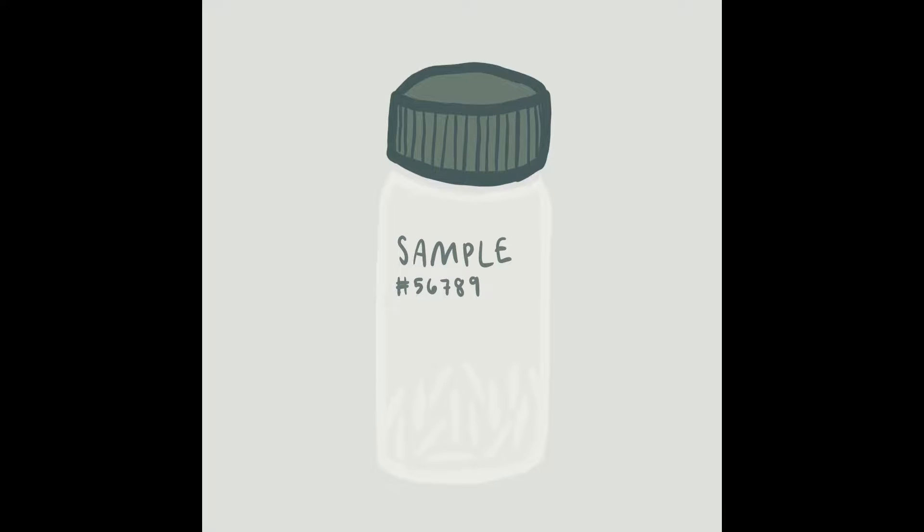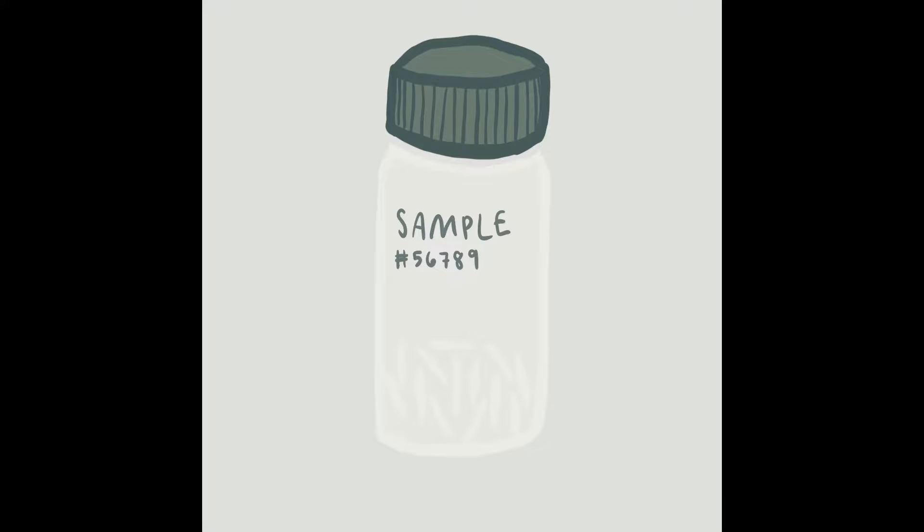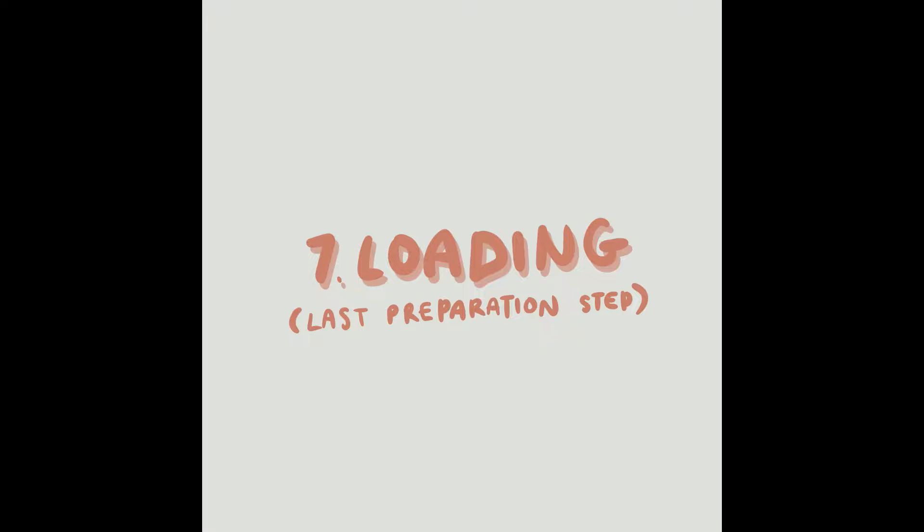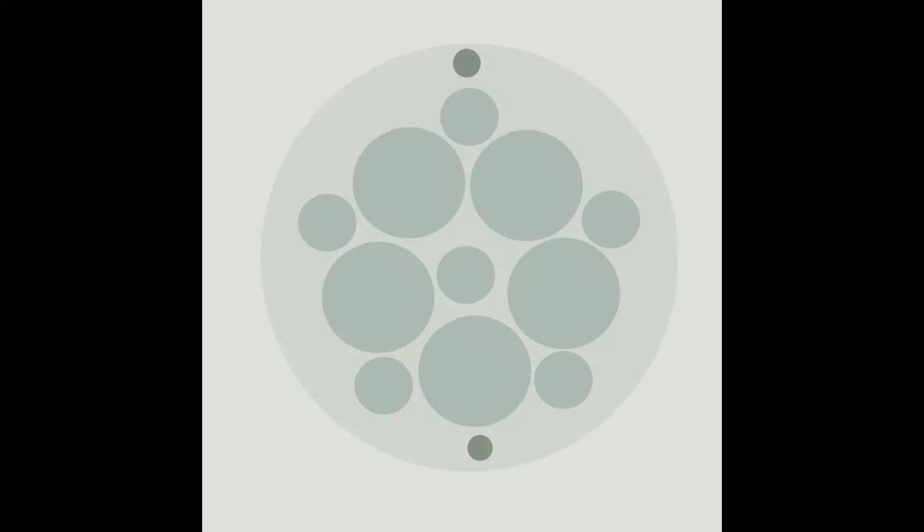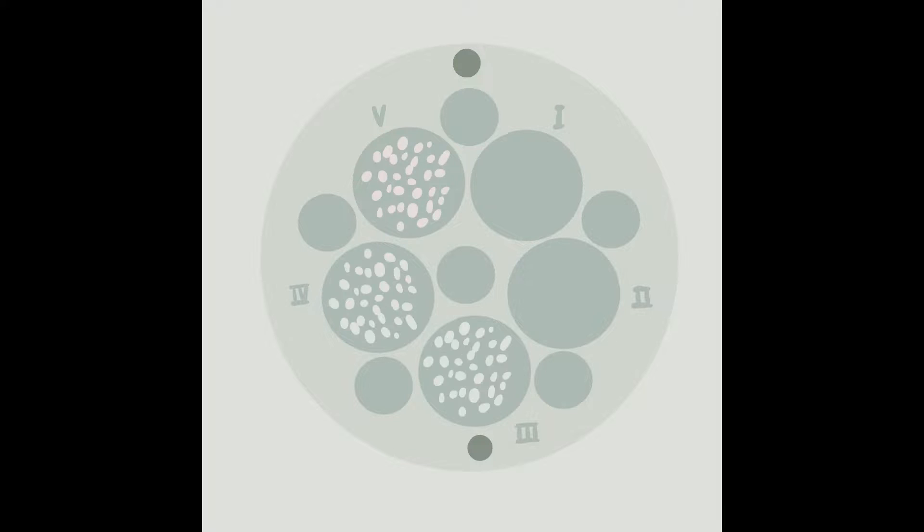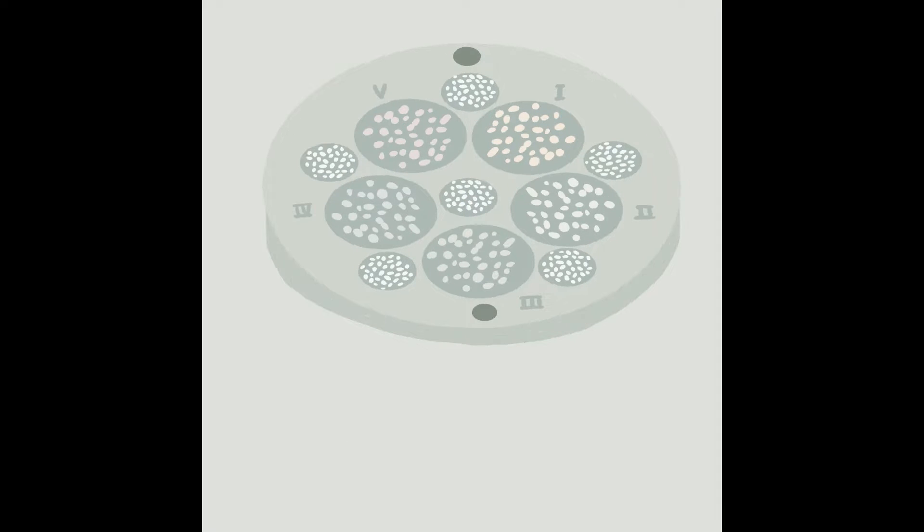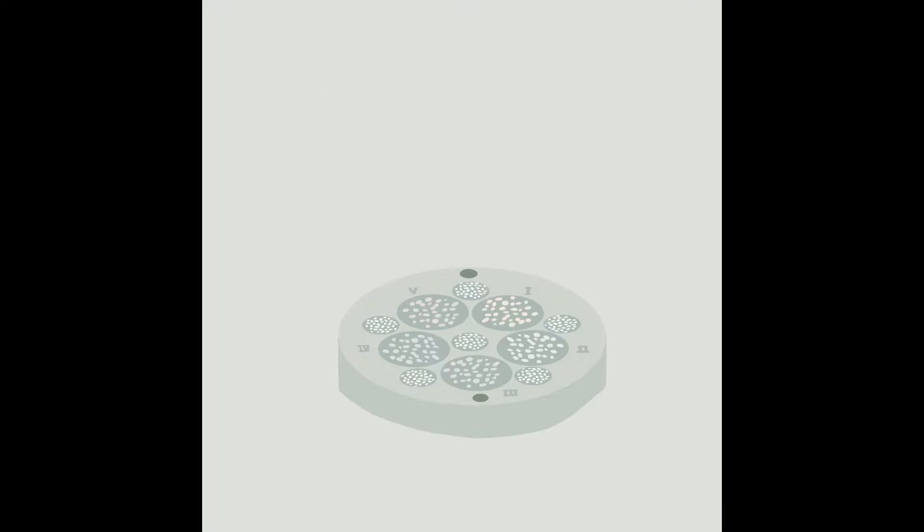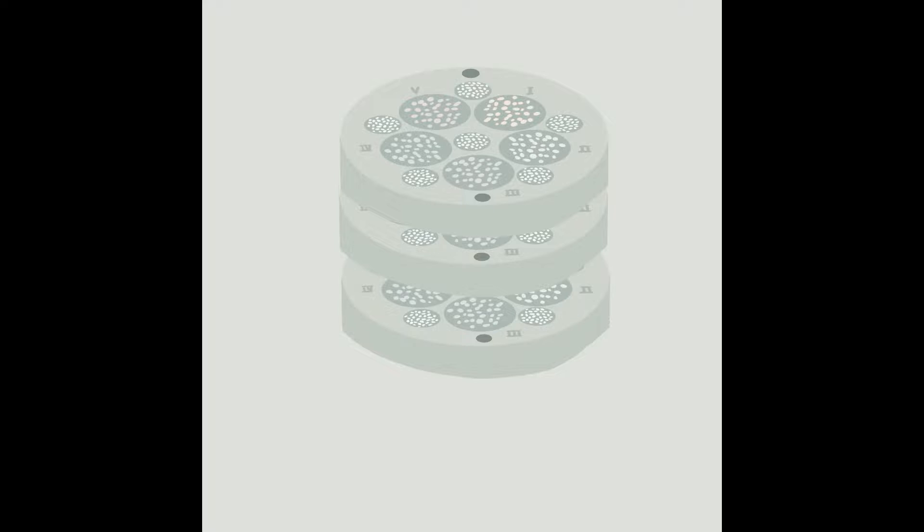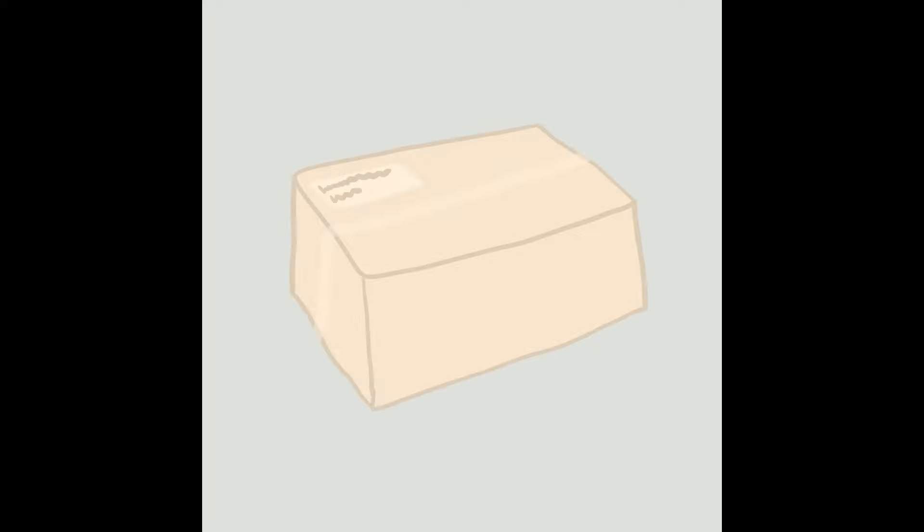The final step of this physical preparation is loading the samples into the larger holes on this disc. These discs are labeled so that we can keep track of which sample is which. Some discs may only have five holes, but some can have as many as 100. Keeping track of which sample is very important.